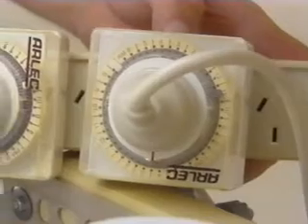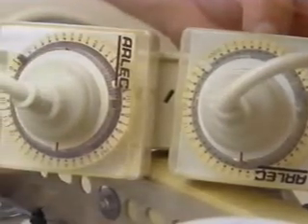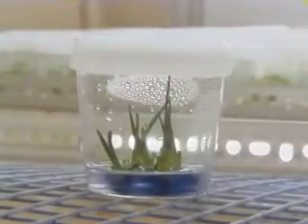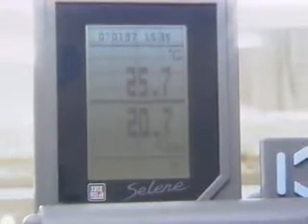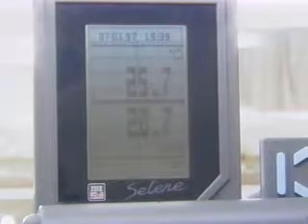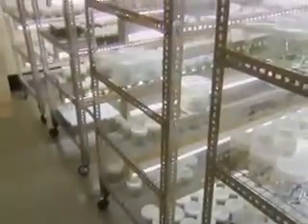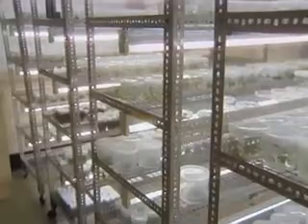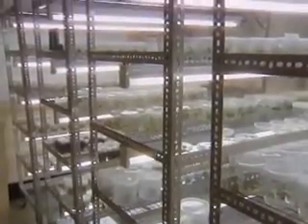The photoperiod, as a general rule, is set at around 16 hours day and 8 hours night, although this might be altered depending on the species and the time of the year you are doing the culture. The temperature of a growth room for most temperate plants is 25 degrees centigrade, 28 degrees for tropical plants like banana, and 18 degrees for alpine plants.